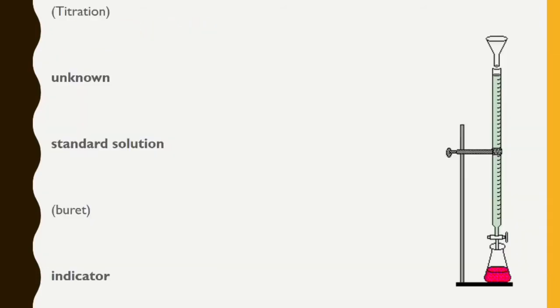So let's start talking about titrations. You'll notice that the word titration and burette are not in your notes. You're welcome to add them if you'd like. I just want to make sure that I explain to you what is a titration before we get into all of the details and complicated stuff about titrations. So write them, don't write them, it is up to you. Just make sure you do write down unknown, standard, and indicator when we get there.